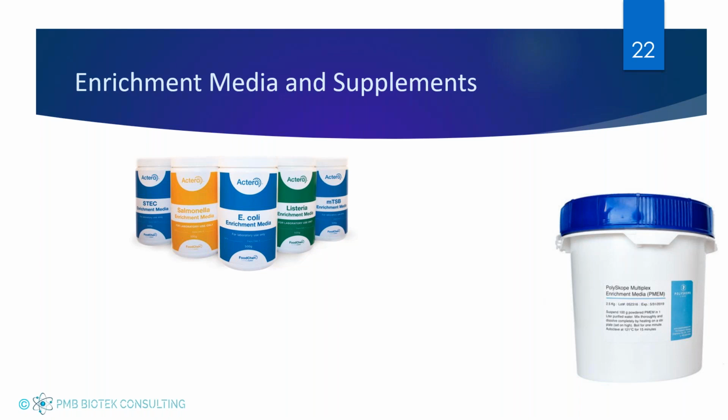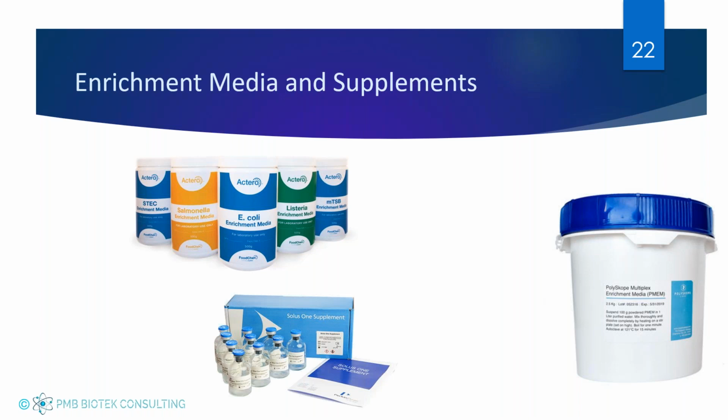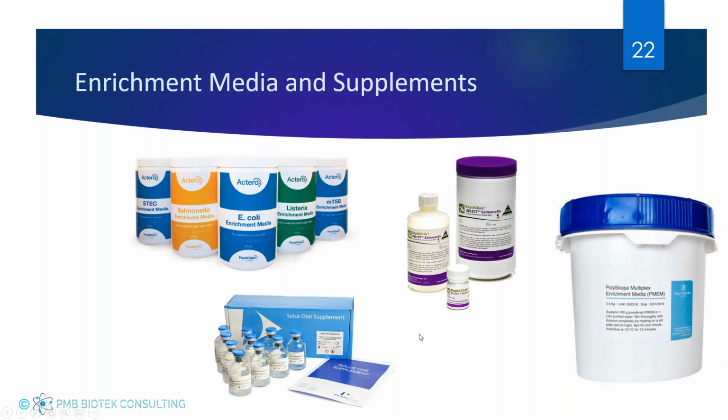So companies need to be able to either develop targeted enrichment media, whether it's for like STEC, pathogenic E. coli, Listeria, that will eliminate the background organisms that are in there, or they'll have specific supplements that they can add to the media that will help either, in this case, the Solus 1 supplement here, that is designed to reduce natural inhibitors from spice products.